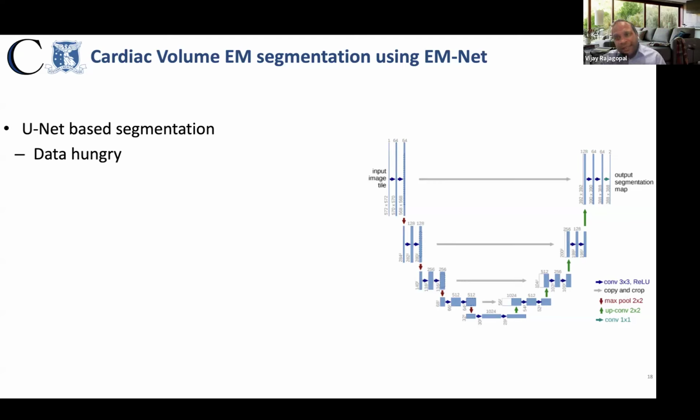They had done it for HeLa cells, which is another cell type that's used in experimental biology labs. And they needed to hire so many summer interns to do manual annotations to get these things to work. And also they needed like 10, 15 AI models for different parts of the cell that they needed to train. And it was this very unique data set. It's this really big, unique data set.